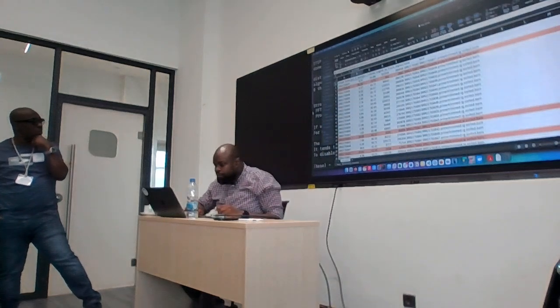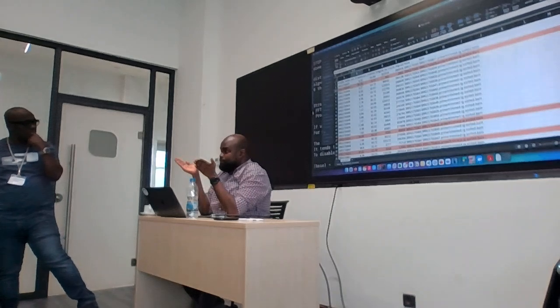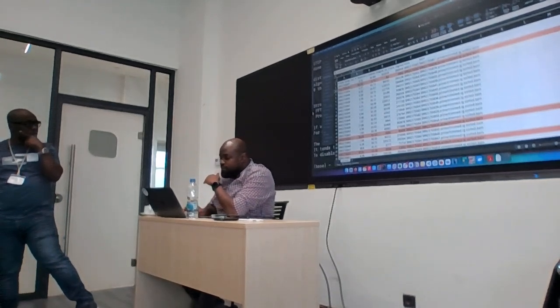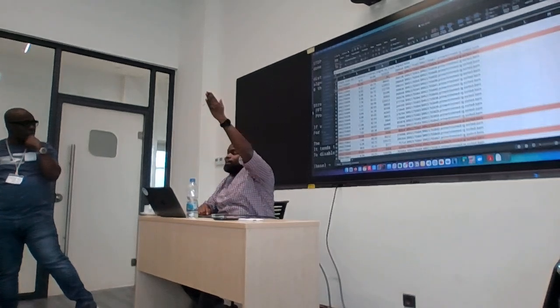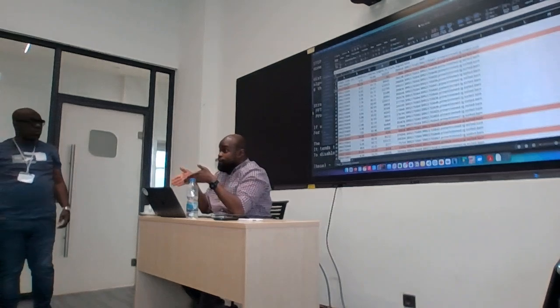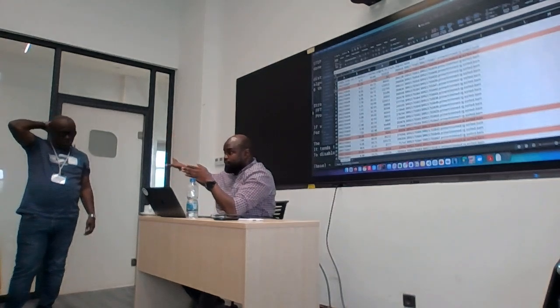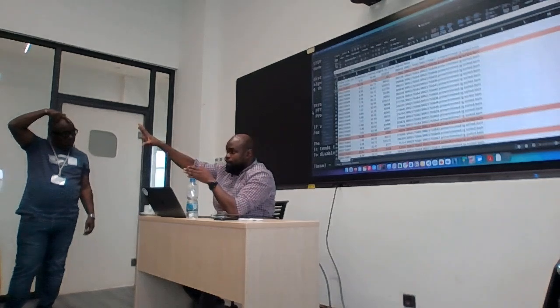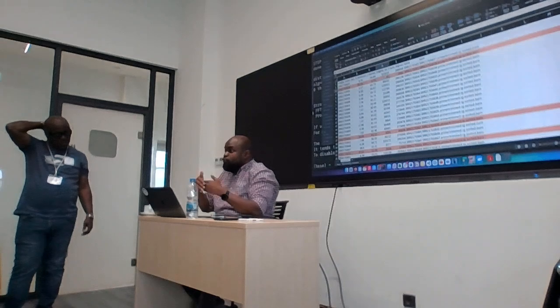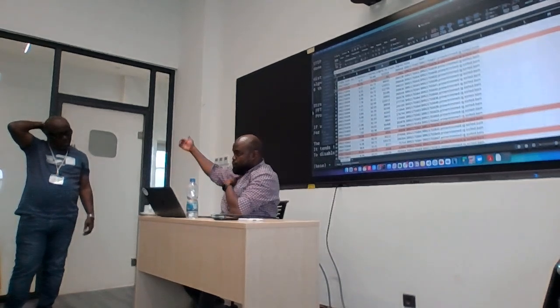So for example, this sequence here has 96% N. Monkeypox has 200,000 bases, right? But we are only able to assemble 583. That's very bad, right? For now, I've included this in our alignment, and we are going to make a tree. I want to see how that looks, okay? But in normal practice, you might even remove this before you do your alignment, okay? But I just let it proceed to the end, okay?